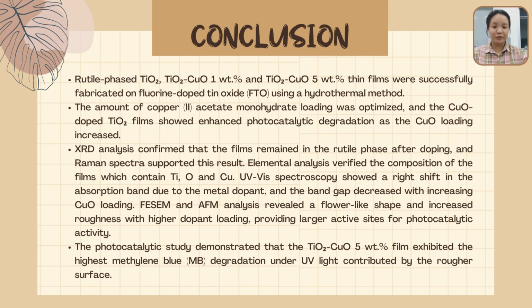Although as seen from the result, the undoped and doped TiO2 photodegradation rate is not much of a difference, which is less than 2%. However, I'm sure in the industry, a slight improvement can also cause a huge impact for the environment, because it means that more contaminant can be eliminated and it can be cost saving over time. And for a large scale operation, even a minor improvement in efficiency can save costs.